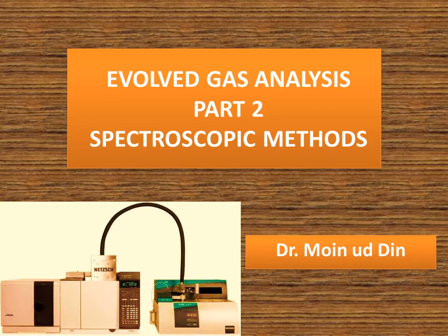In this video we are going to discuss evolved gas analysis. We have seen earlier various thermal methods of analysis, and we have seen that at different intervals different gases are evolved. Sometimes we might be interested to know the nature of these gases. So these things are performed in this technique, which is called evolved gas analysis. And this is part 2, in which we will discuss the spectroscopic methods.